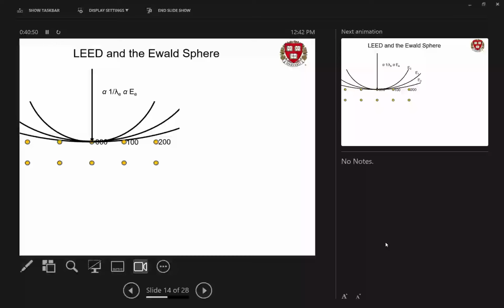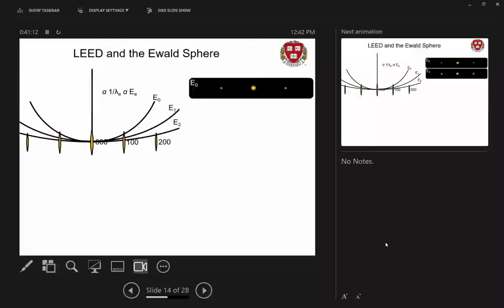In the real world, instead of being these little spots, these are actually these sort of elliptical, almost stretched out spindle-shaped zones called rel rods, which is another term you might've heard once in a diffraction course and never again, which is very fortunate because since they have some actual vertical extent in this construction, it means that we can actually intersect them with our little disks.